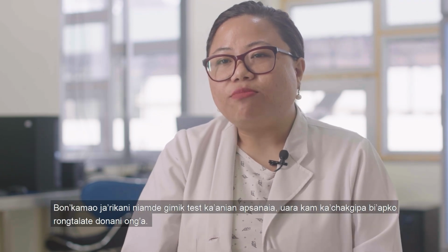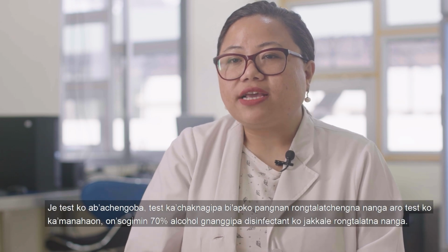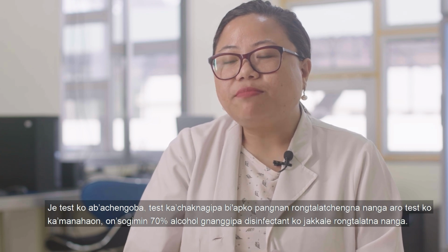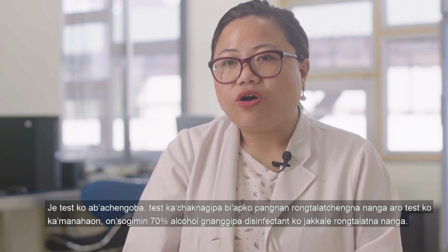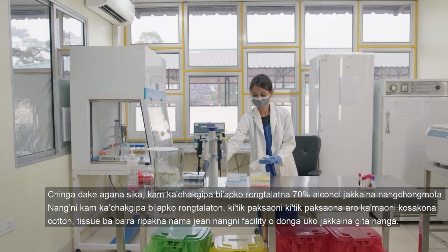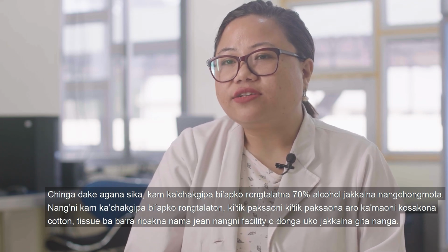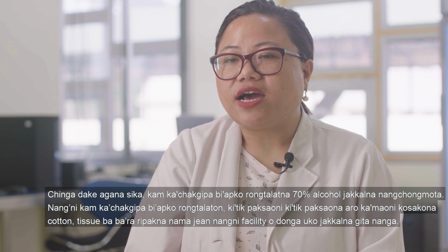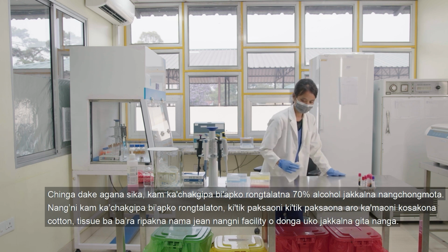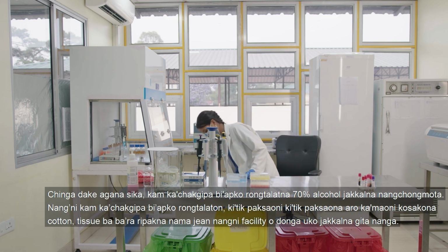The last step that is common to all testing procedure is the cleaning of your working surface area. Clean your working surface area before conducting any test and after conducting any test with the help of 70% alcohol or any kind of disinfectant that is provided to you. We advise that 70% alcohol is enough to clean your working surface area. The direction of cleaning your surface area should be either from one side to the other side or from top to bottom in a unidirectional pattern using either cotton swab or a tissue paper or any kind of absorbent material that is available in your facility.